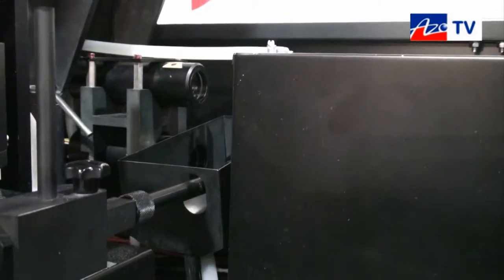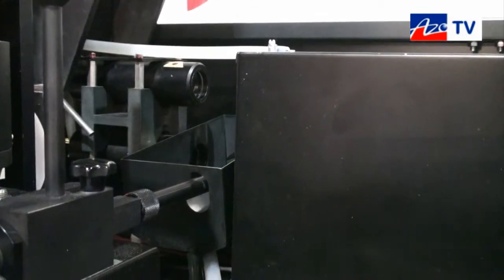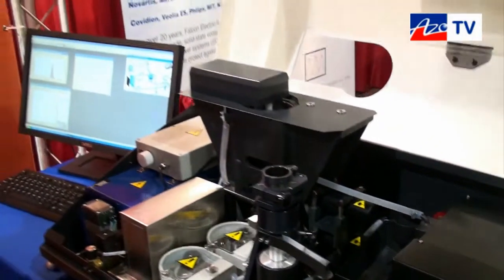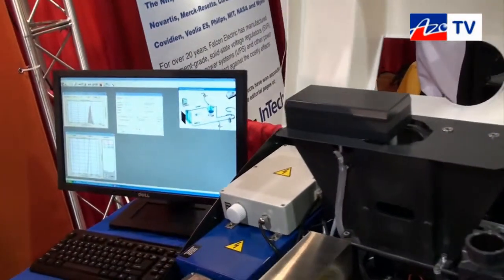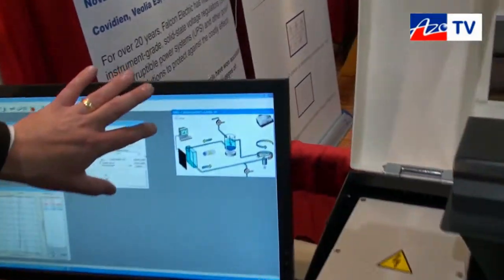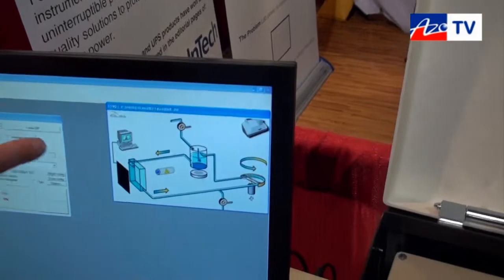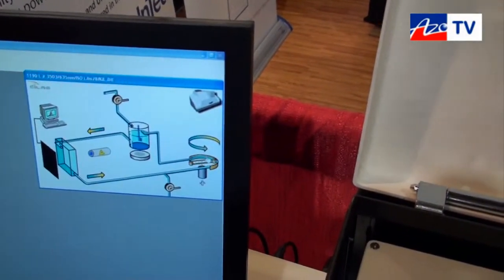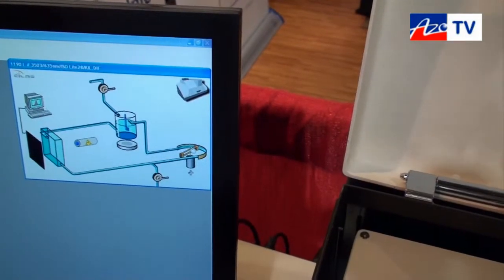To show you some of the software, how we control that, for example, is we have a WYSIWYG or a mimic screen. By WYSIWYG I mean is what you see is what you get. So if I click on the pump icon it stops on the software and it also stops on the pump itself by clicking it on or clicking it off.